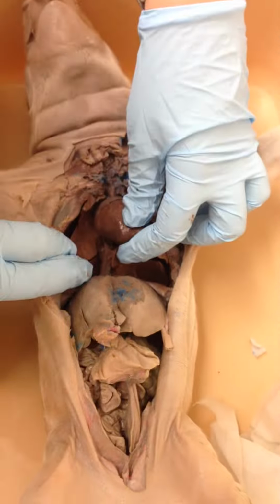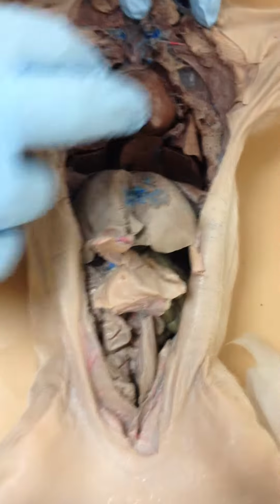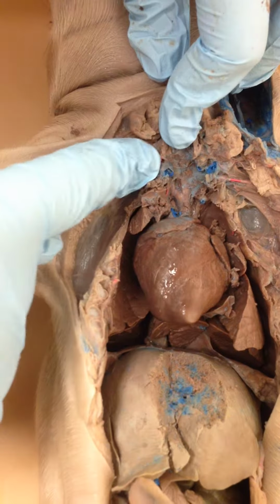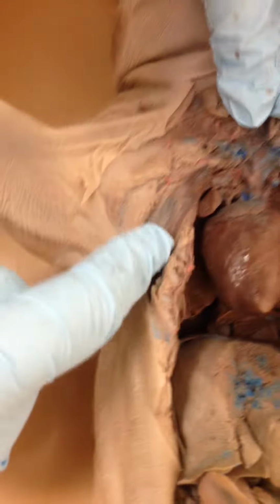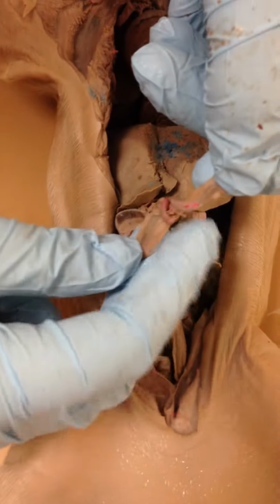Next is the right pulmonary artery. The right pulmonary artery comes out of the top of the heart and goes this way. Umbilical arteries. You can see them right around here, the little ones.